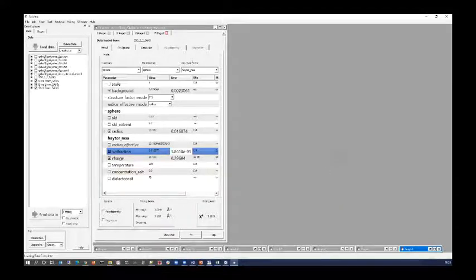We could fit each of those independently, but if we think about it, the structure of what's in those 3 samples should be exactly the same, unless something really funny is going on. So really what we would like to do is fit one model across the three data sets, and that's called simultaneous fitting.